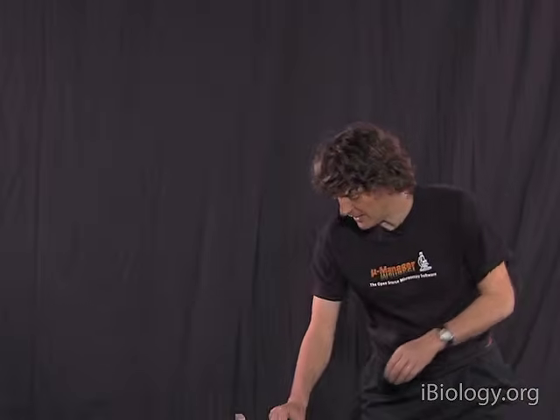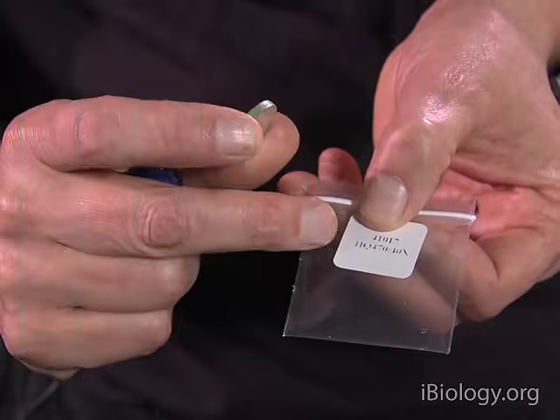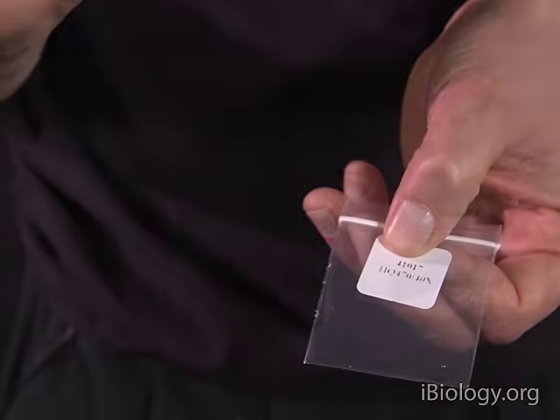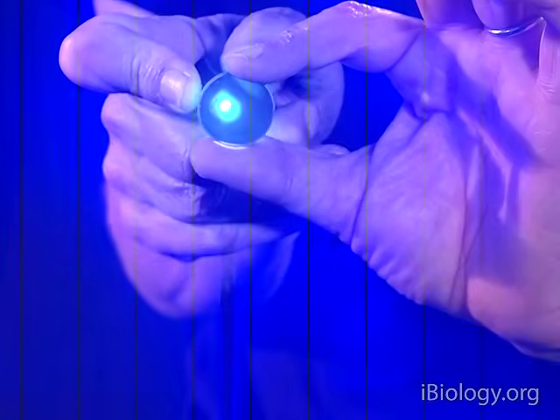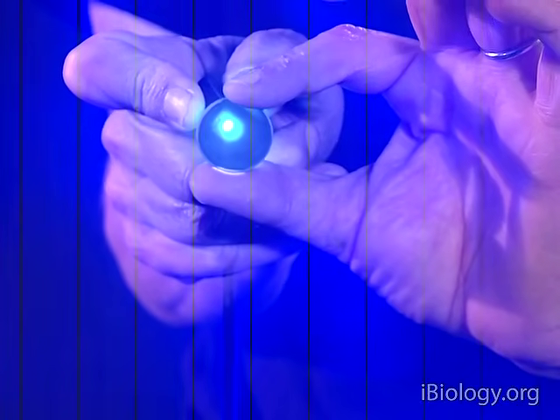Okay, so I have an example here of such an interference filter. This one is called a HQ47040, and the 470 is the center wavelength of this filter, and the 40 means the bandwidth. So this one will pass blue light, and so if I have my blue LED and I hold that up, I see the blue light coming through, and you will see that this LED indeed passes it through.